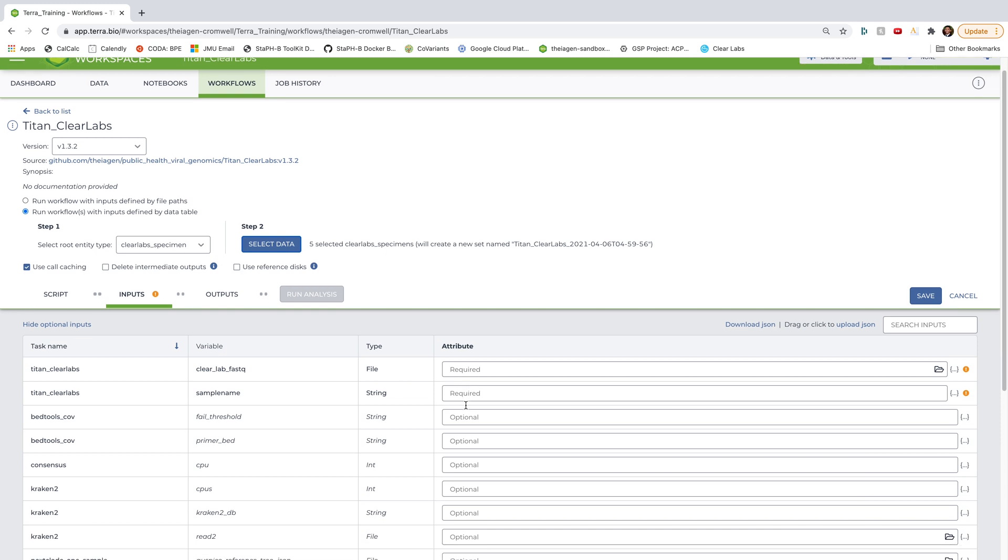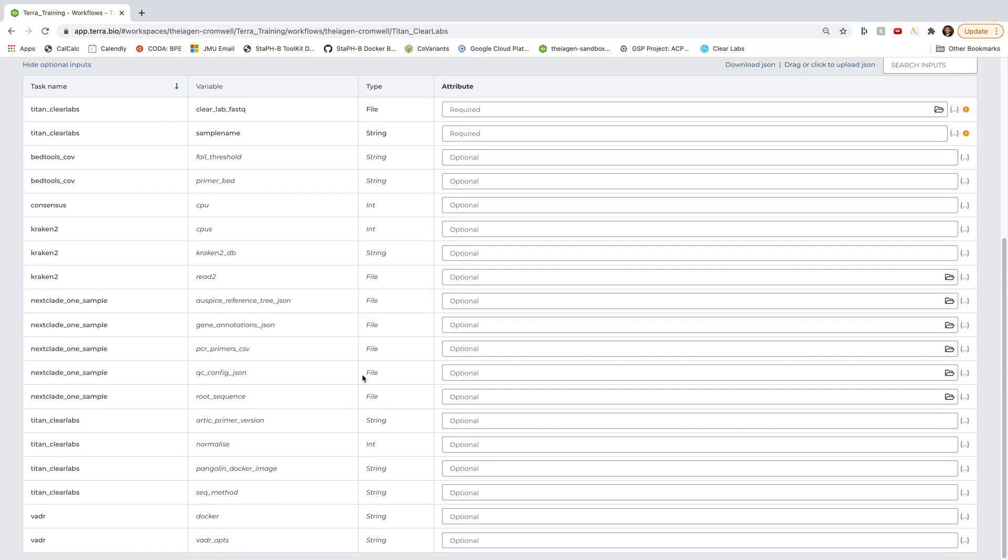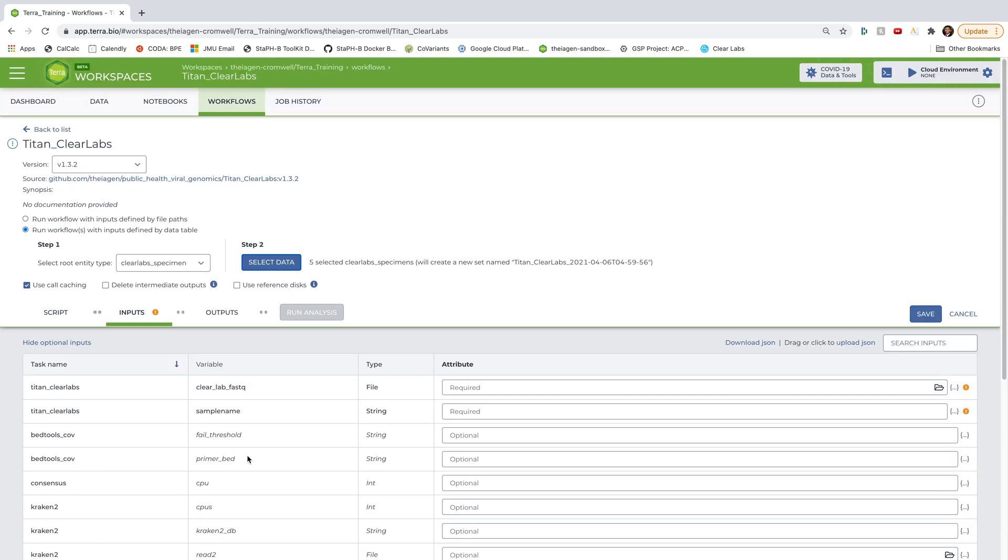For most users, you really won't have to worry much about these parameters as the default settings have already been optimized for Clear Labs data. The one parameter you may want to update in the future is this pangolin docker image input. But I'll go ahead and save that for a future video. For now, we'll just focus on these two required inputs.